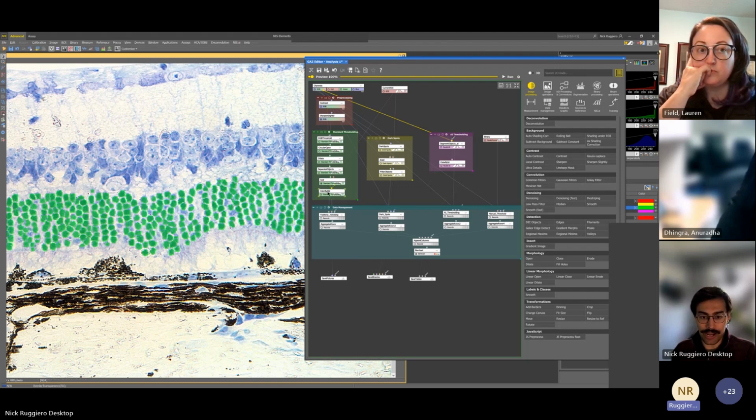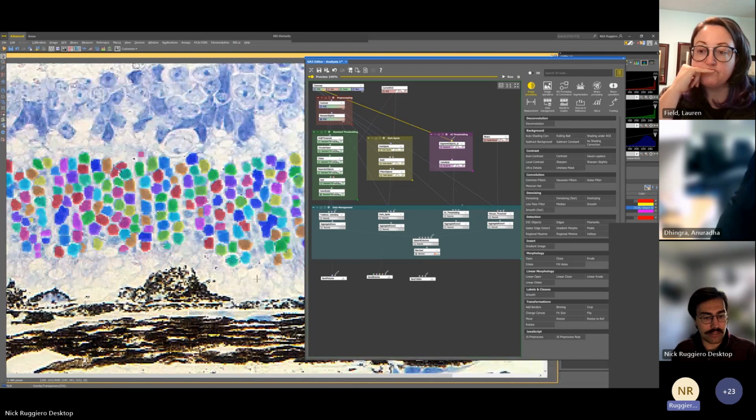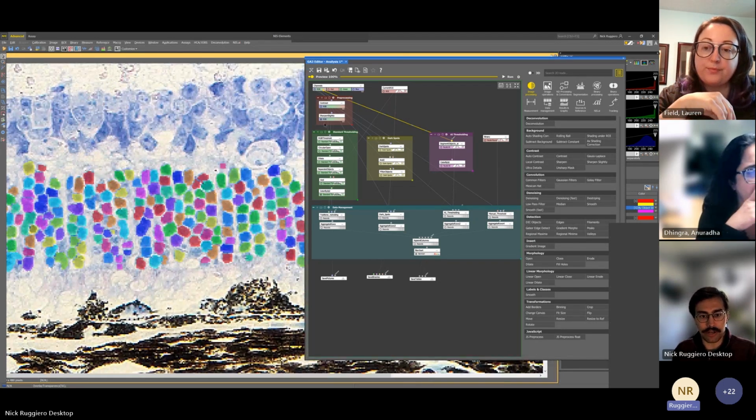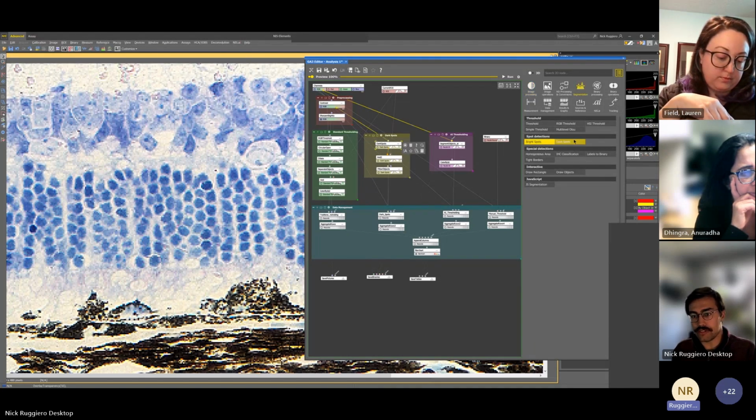And going back to that color by ID, I pulled one of those in just to see if I could get a better idea of what it's doing. And it doesn't look terrible, but I think that we could do a little bit better. So the next one that I went with is our dark spots detection. That is a function that lives in spot detections under segmentation.